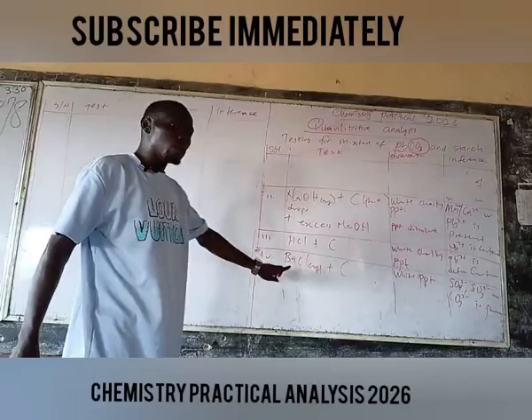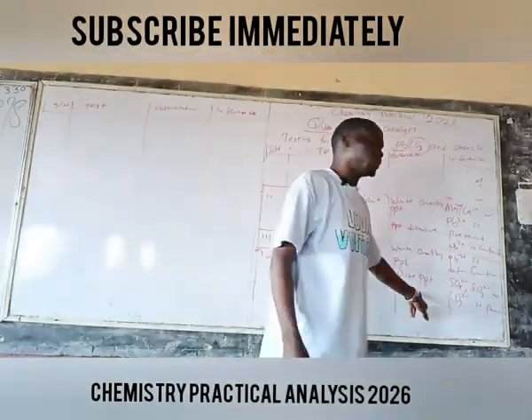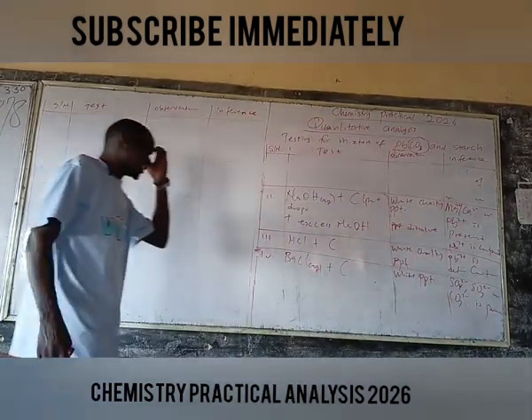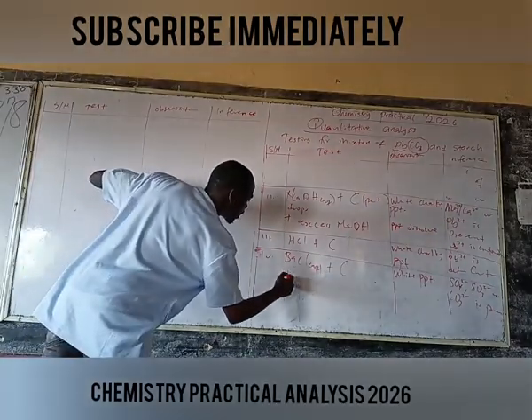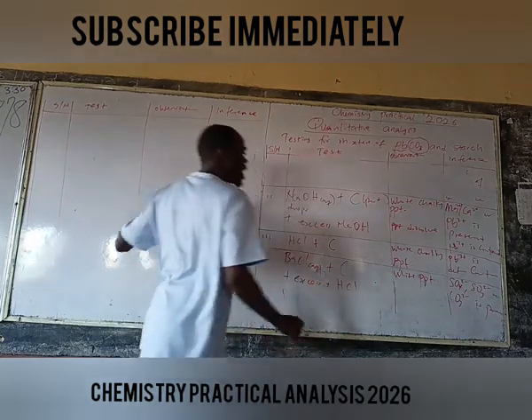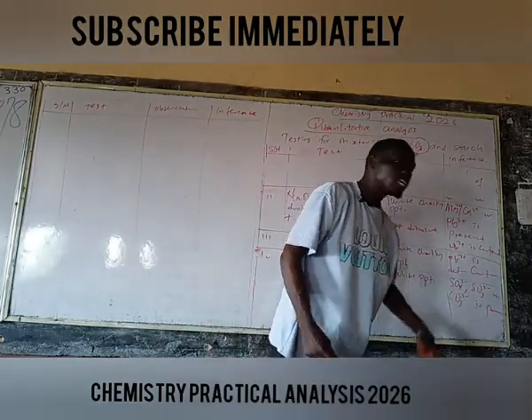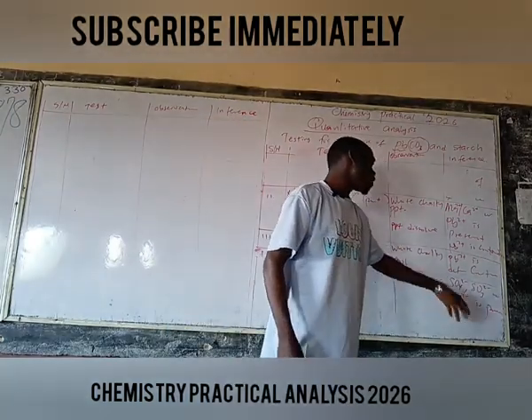Continue this. When we have barium chloride plus that salt and a white precipitate forms, then we say SO4 2 minus (sulfate) and CO3 2 minus (carbonate) are present. Now, adding HCl: if the precipitate dissolves, then SO3 or CO3 is present. If the precipitate remains undissolved, then SO4 is present.